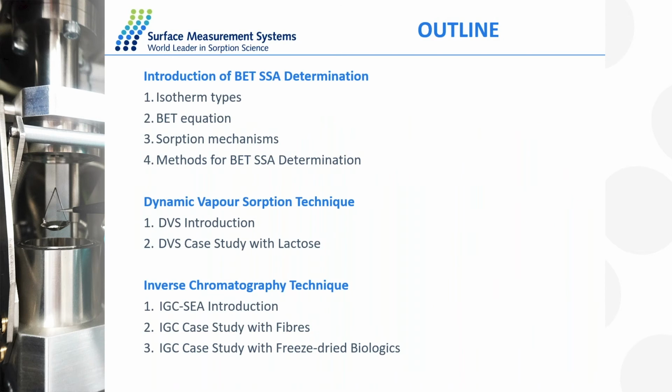So here's the outline of the presentation. We will first have a brief introduction about the BET surface area, and then I will introduce some basic information about the two techniques, as well as the application and the case studies related to the BET surface area determination.